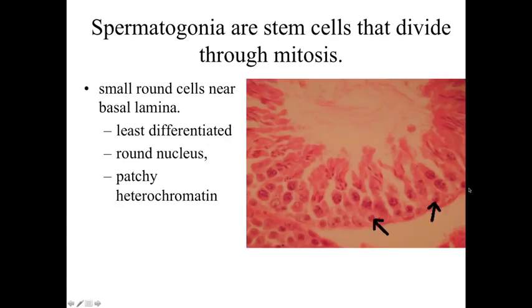This is a nice high magnification view. You can see the basal lamina in the region here separated a little bit — that's an artifact from the way the tissue was processed. Normally we'd have that loose connective tissue down in that region, then the seminiferous epithelium, and ultimately the lumen. We can see some of the flagella from the tails of the more mature spermatozoa up at the top. At the base level, we're going to see relatively undifferentiated cells capable of dividing, pushing some of those cells up into the epithelium, and as they move closer and closer to the lumen they become more and more differentiated.